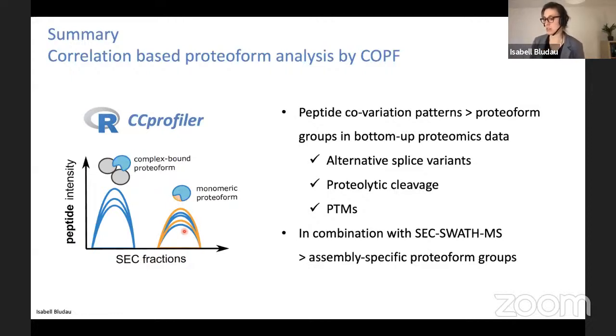Overall, this works in the data, especially if you have enough fractions. Then you can extract quite some PTM information from the data, as you could see also with the targeted Skyline extraction, where you would hope to find both the modified and also the unmodified peptide.